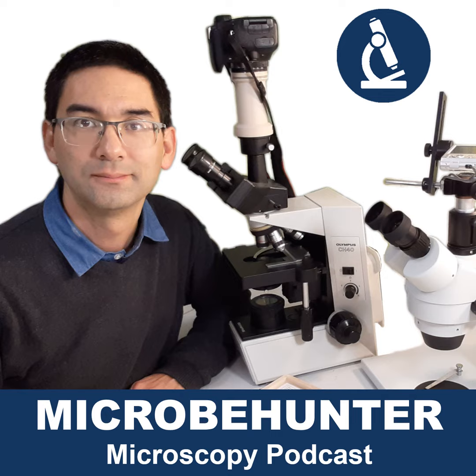And one of the reasons is that it's almost impossible for a person to make good microscope optics on their own. We simply don't have the tools. There are some folks who actually did that, and they tried to replicate the very first microscopes by making their own microscope lenses. That is possible. You can also buy microscope objectives relatively cheaply, and then you can build the rest of the microscope around it. But I would say it's not a very common one.